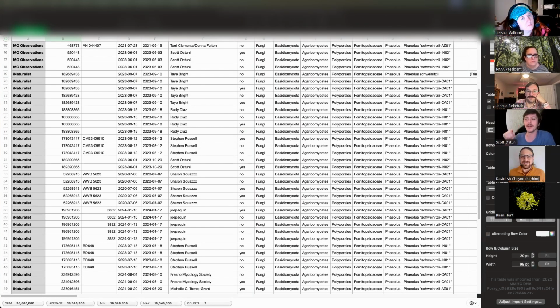Once you import it to INAT, at some later point, on a refresh of external data, a lot of the times that sequence box will have a duplicate sequence, reflecting that it's also in INAT as part of the INAT observation. So not only do you have the sequence that was imported into MycoMap for that observation, but it also pulls that identical sequence back in. And so now your S equals 2 in that box.